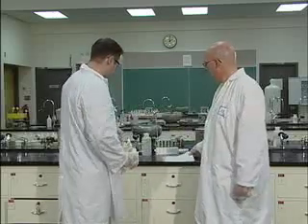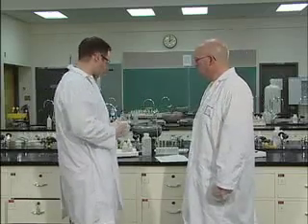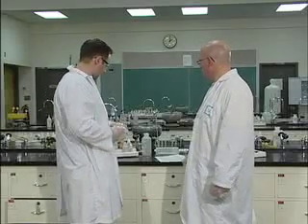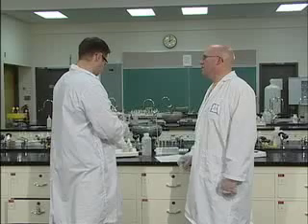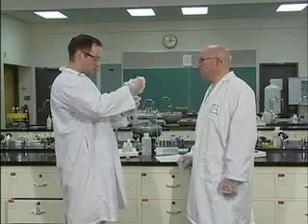Now part B is a little bit more exciting. Single replacement reaction. Again, we have our labeled test tube. In this labeled test tube, we're going to put 30 drops of hydrochloric acid. Now this is 6 molar hydrochloric. Be careful. Don't taste this one. This is a dangerous one. So again, 30 drops.